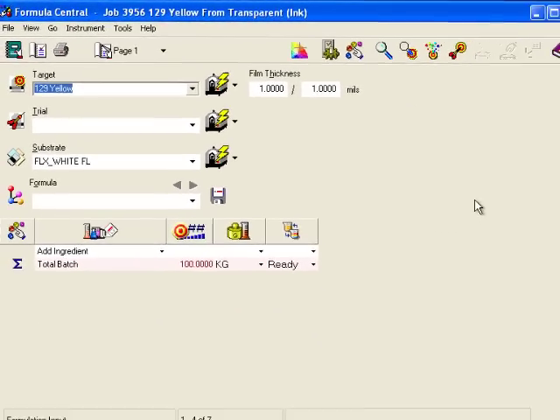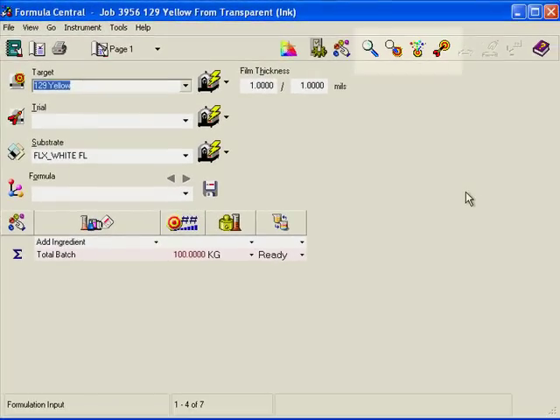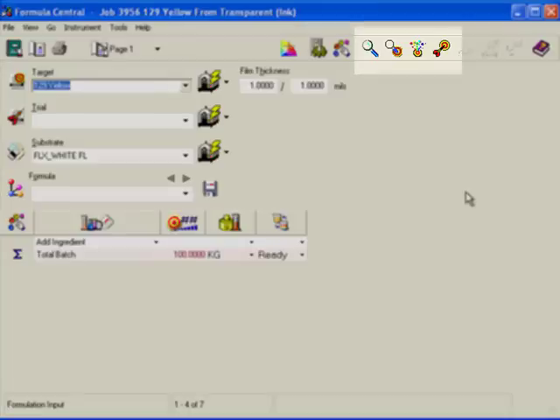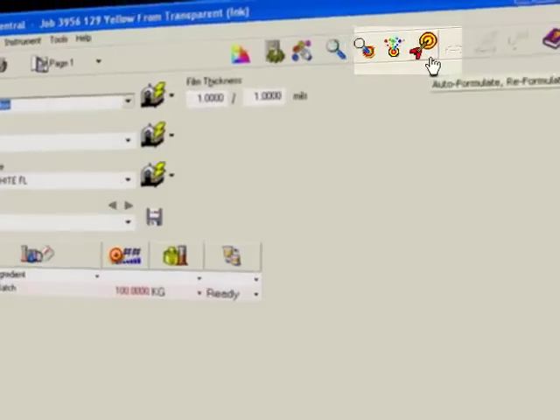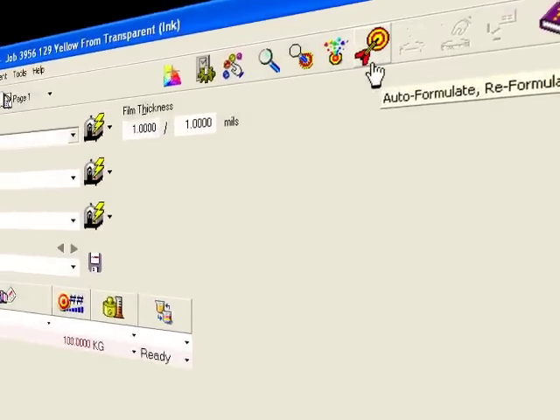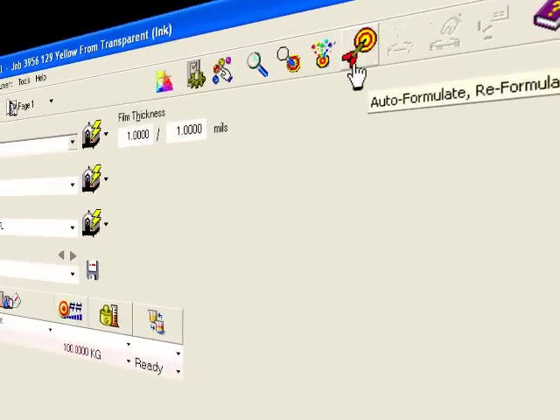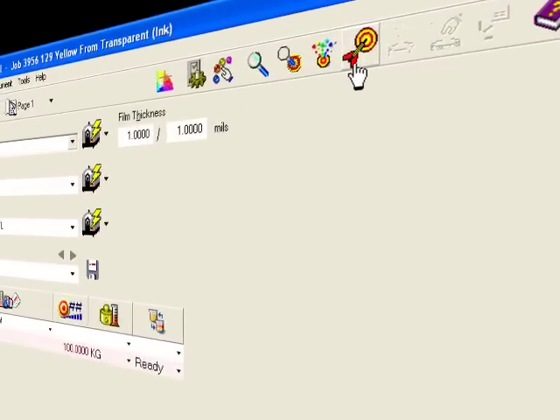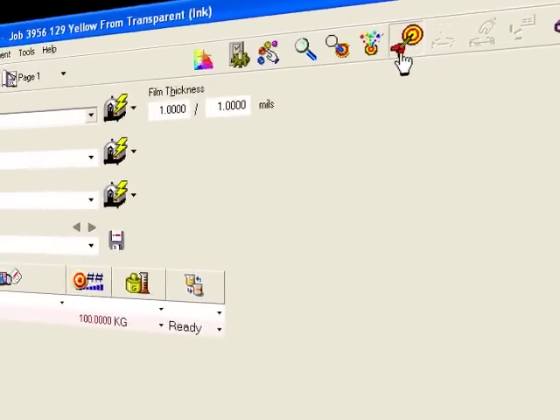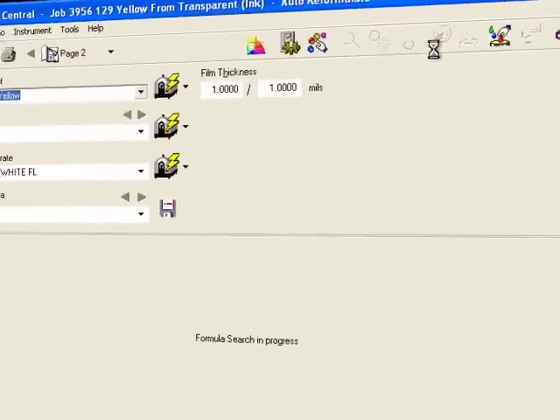Once we've given a target color, the toolbar buttons come to life. Clicking this button, Auto-Formulate, will use our saved preferences and show us a selection of predicted formulas.